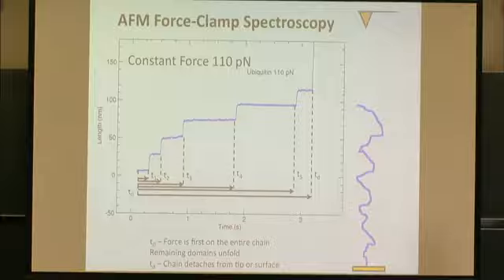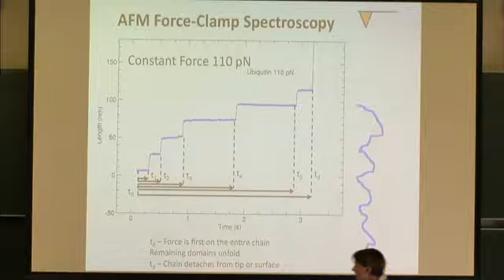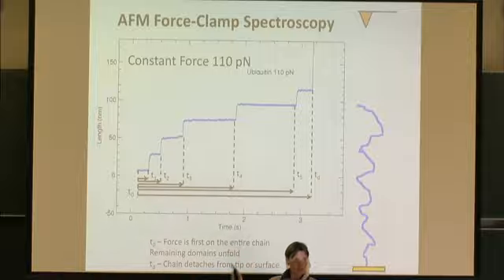Why don't they all unfold? Because it's a stochastic process. Even if it was a 2-state model with a single free energy barrier, you'd have an exponential distribution of times for pulling k out of n molecules, where n is the number in your chain and k is the kth one that you're looking at. Yeah, this is just time, and indeed there is a trace that shows you've applied a constant force at time 0. So that's the statistics you collect.